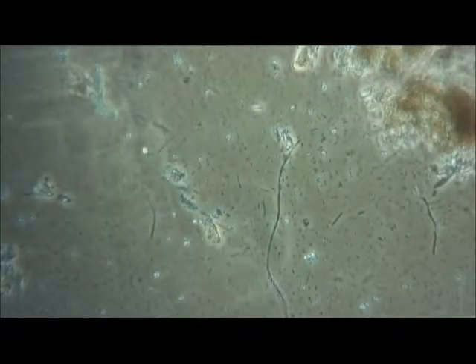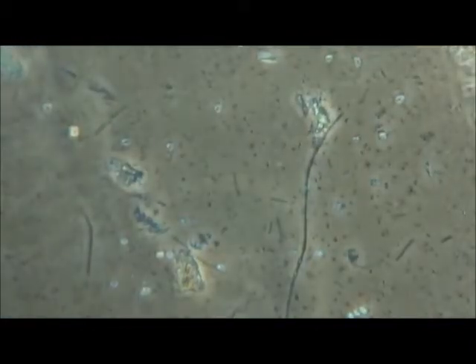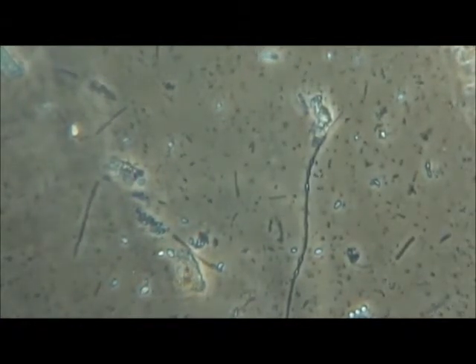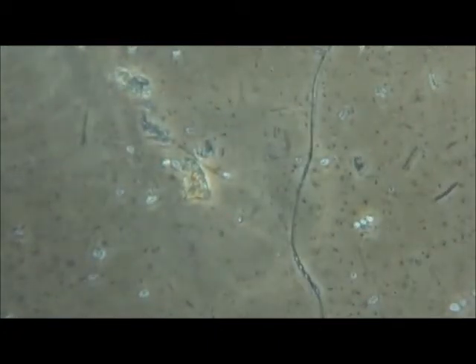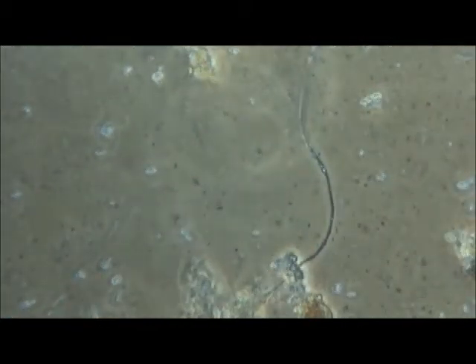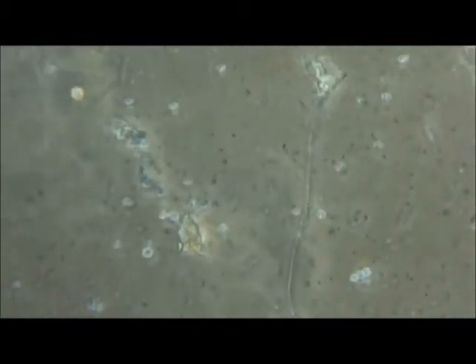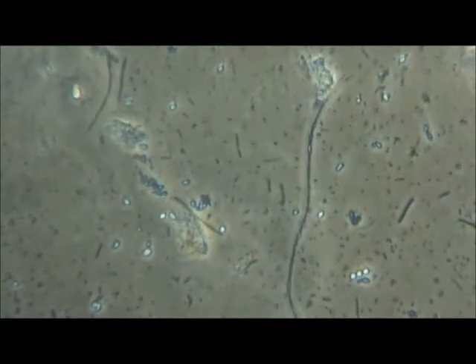And in the same sample, here's some bacteria up close and personal. Even the long strand there is a bacterial formation. You can see that there's spores, those white dots that are running the length of it. That's one way we can tell that it's bacterial. And also it's much thinner than fungal hypha. And the long rod bacteria are most likely a species of lactobacillus.